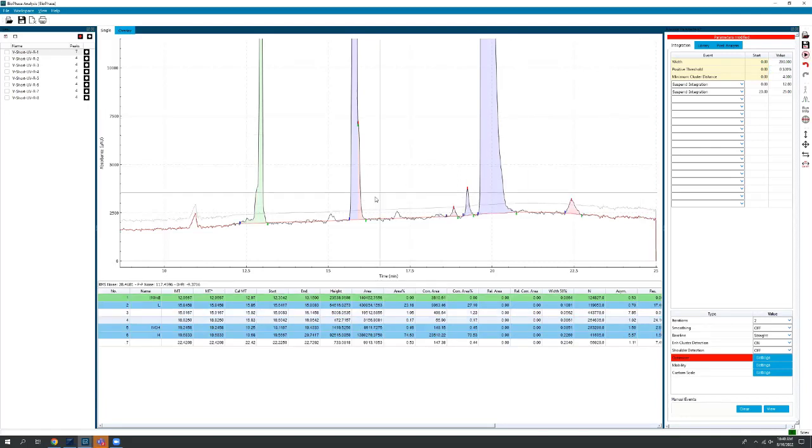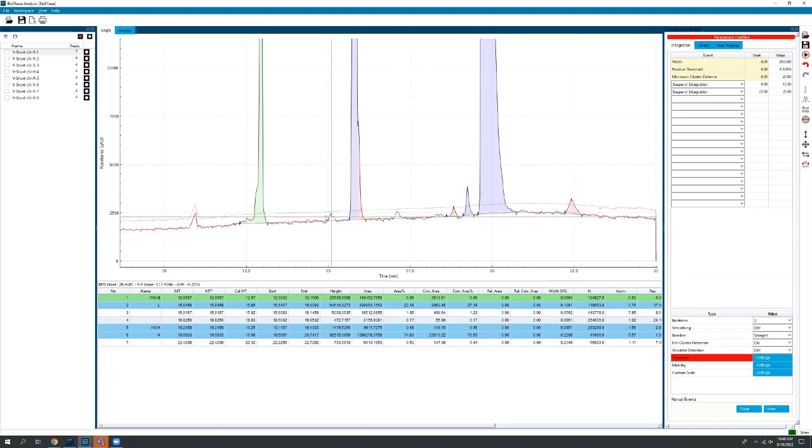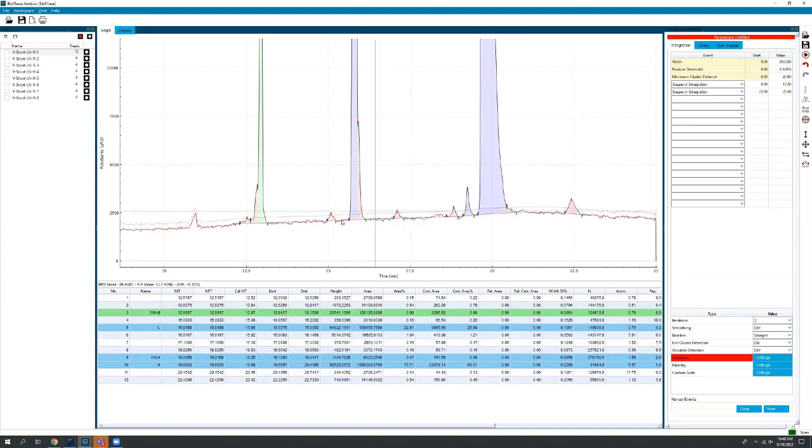And you can see that as I change it, this gray line comes down, and as the peaks cross above that gray line, they are now considered peaks. So we kind of want to get these last couple of peaks here. We might bring that down just a little bit more, see how that does. So there we go.